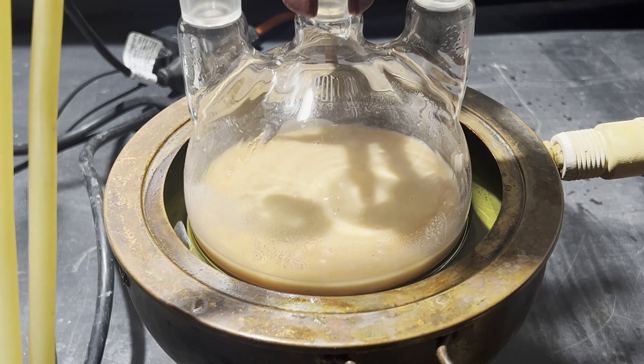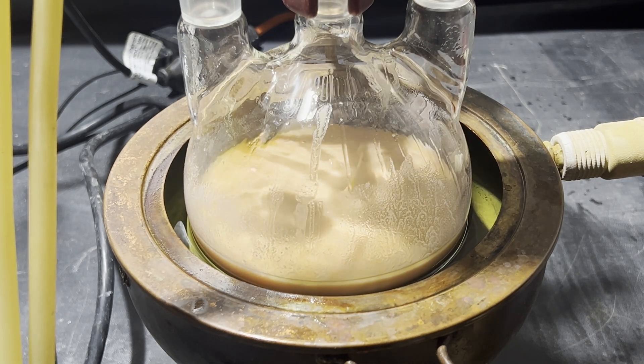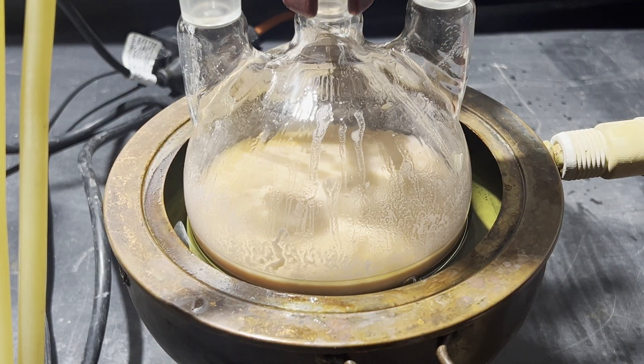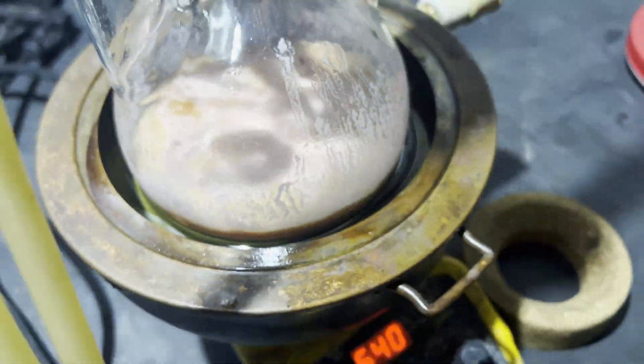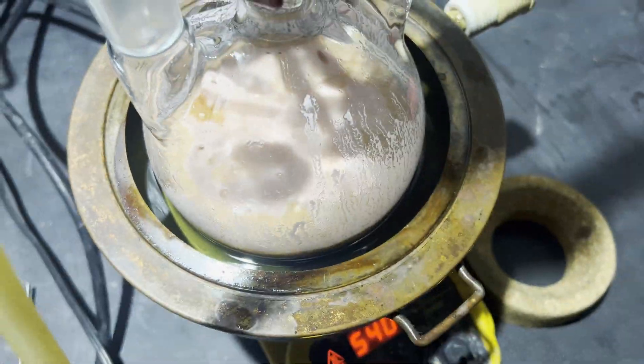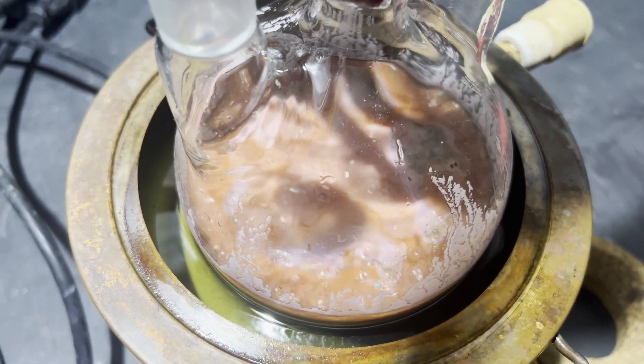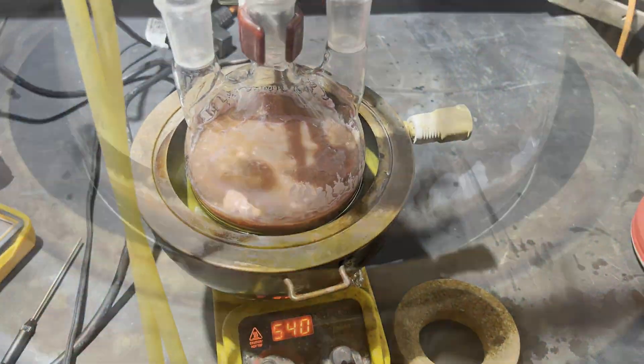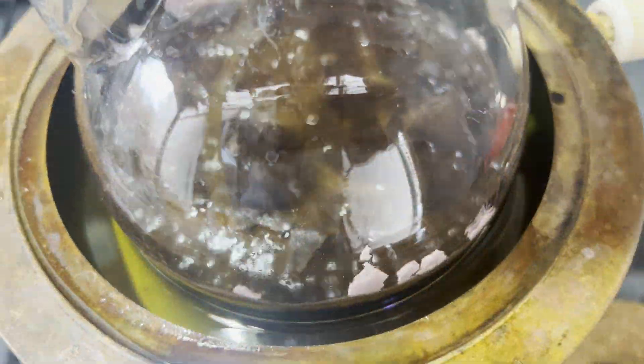After adding the diester, a thick precipitate forms, so there's no way magnetic stirring could be used. Then, I refluxed the mixture for 24 hours straight. A few times, I lifted the flask out of the bath and shook it a bit, but I don't think it was necessary. It was more for a false sense of security.